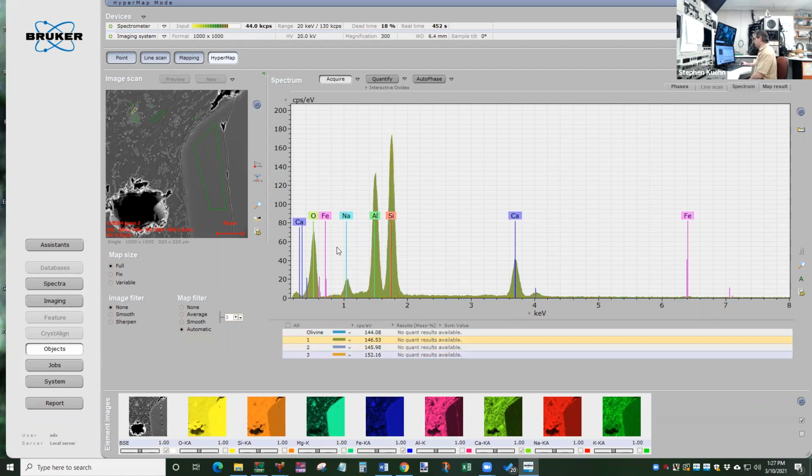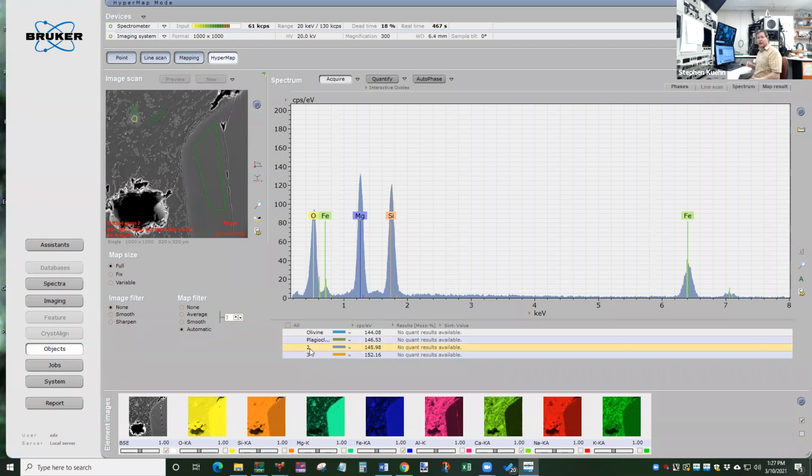All right, so this one: calcium, silicon, aluminum, and sodium. This is plagioclase feldspar. And it's actually the same as the big white crystals in this rock. So actually, I don't have to go looking for any of those. We've already got the mineral here. So it's both in the big crystals and in the small crystals.